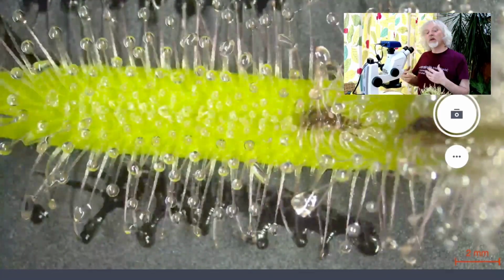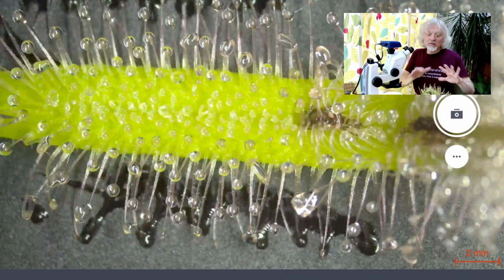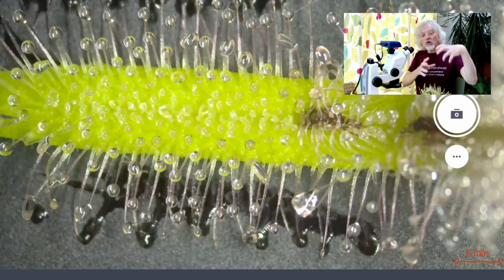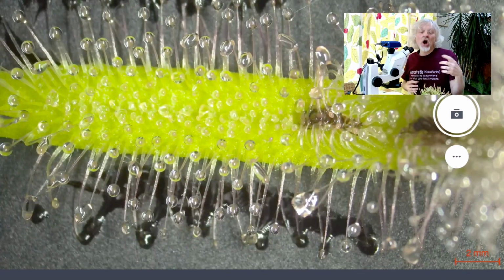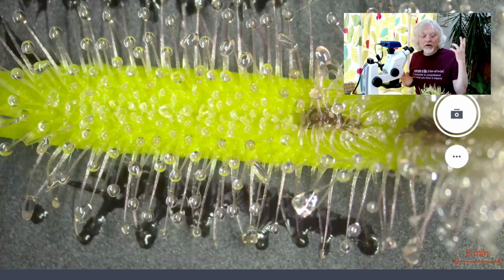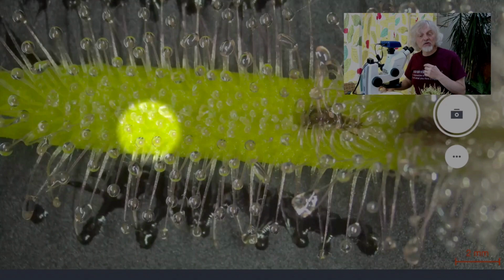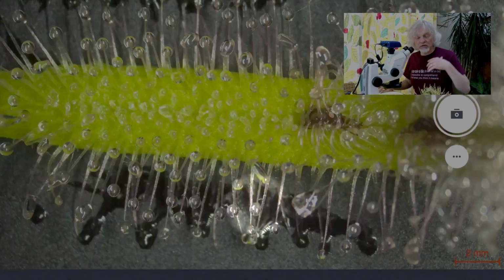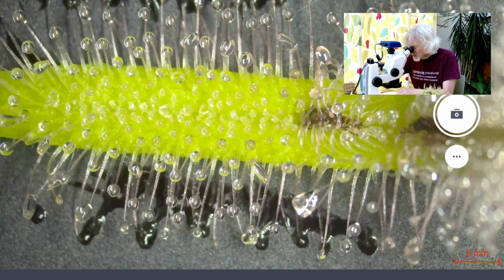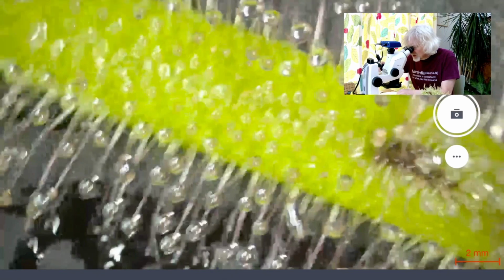The sundew plant is characterised, and the reason why they're all called sundews is because they're covered in these hairs. The leaves are covered in these hairs, and at the end of each hair there is a gobbet of sticky goo, okay? And you can see them. So here's the leaf here, the green bit, and these bits here are all, they're actually called tentacles, covered in the sticky goo. So I'm going to zoom in on some of these and show you what's going on.